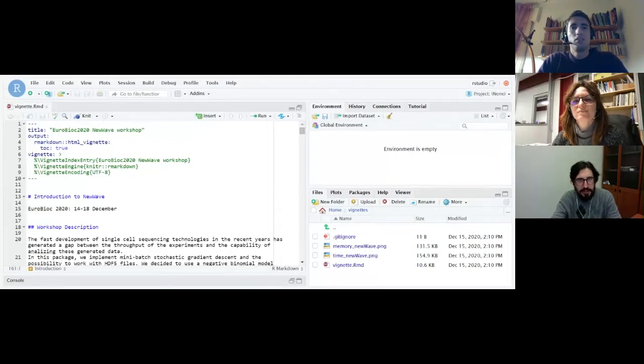The one that we will follow in this session is NewWave. If you look in the table, you will see one workshop with the title that I just posted in the feed, and you can click on that and launch, and it should create an RStudio session in which you can log in with RStudio as a login and RStudio as a password.